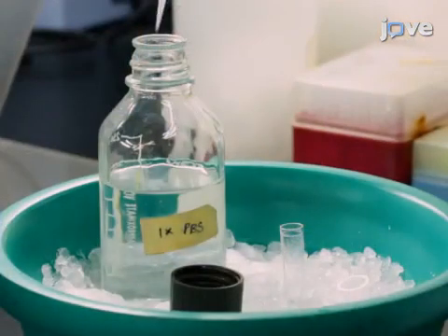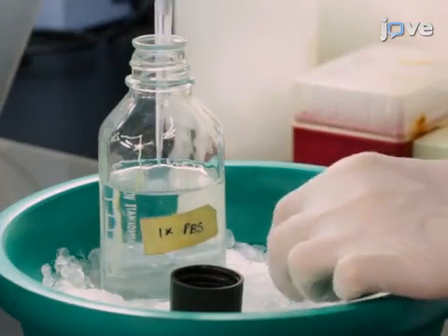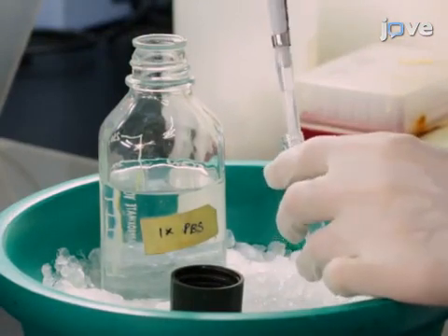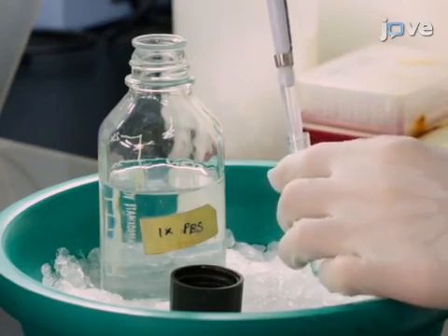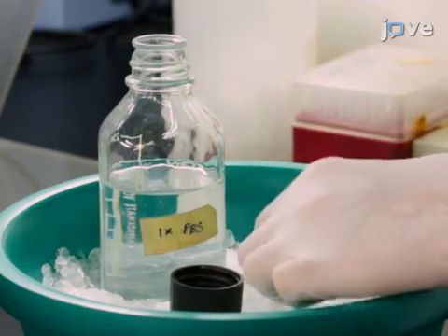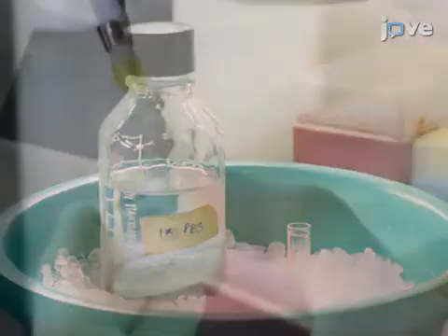After two washes by centrifugation, re-suspend the pellet at a 5 to 10 times 10 to the 6 cells per milliliter concentration in 200 microliters of cold PBS buffer and add 5 microliters of biotinylated anti-human antibodies.